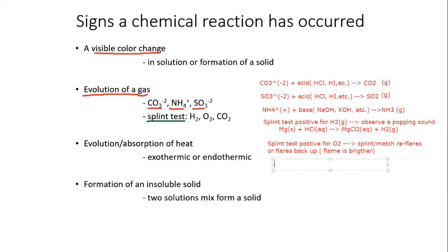Now for CO2, if CO2 is present, it's going to extinguish the flame or splint.